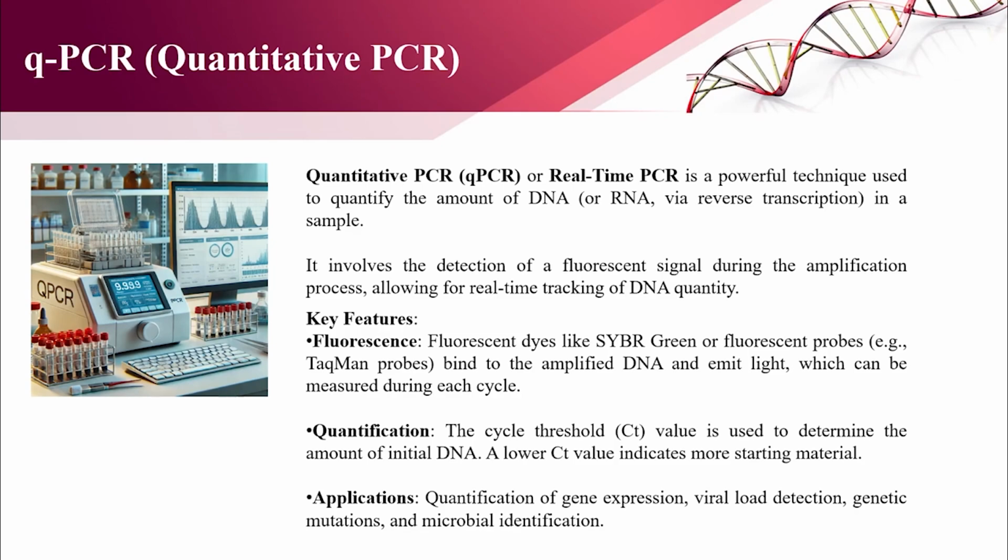So the key features are, the first one is the fluorescence. Fluorescence dye like SYBR Green or some fluorescence probe like TaqMan probe bind to the amplified DNA and emit light, which can be measured during each cycle. So this is the key feature.